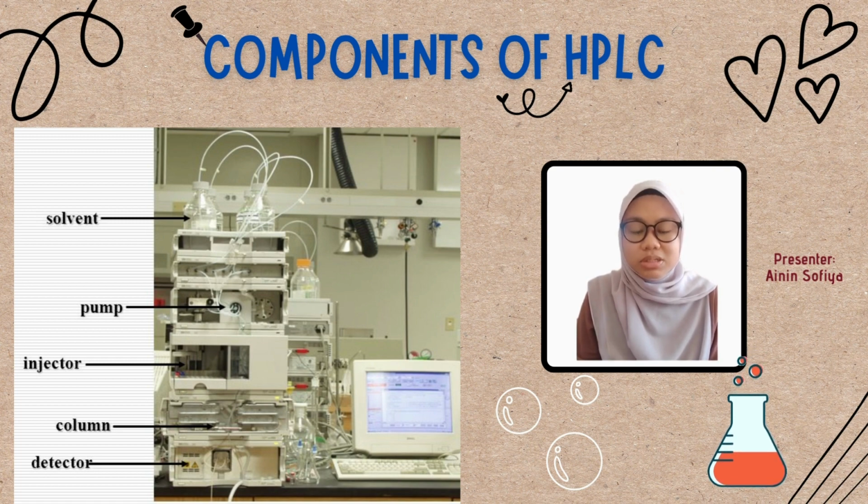Next, the pump is one of the most important components of the HPLC system, generating the flow by the back and forth motion of the motor-driven piston. Pumps can be classified into constant pressure pumps and constant flow pumps according to the factors of constant output liquid. The performance of the pump directly affects the quality of the entire system and the reliability of the analysis results.